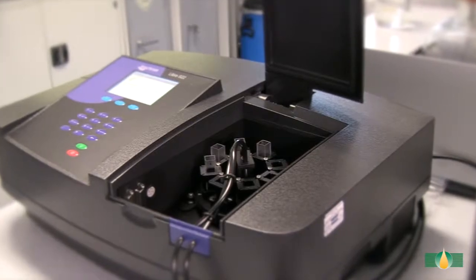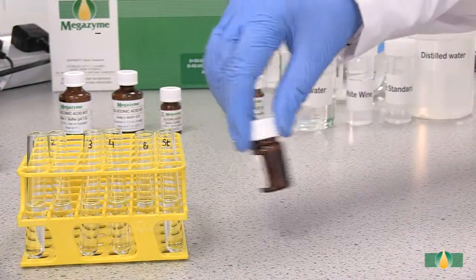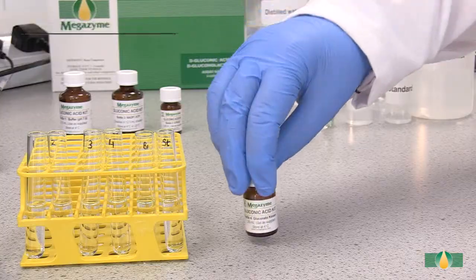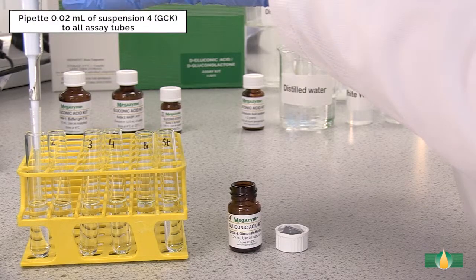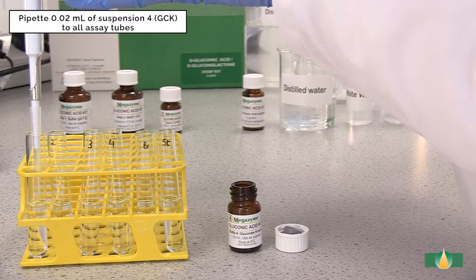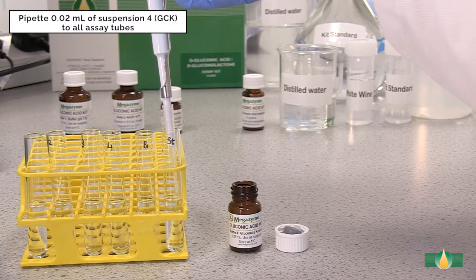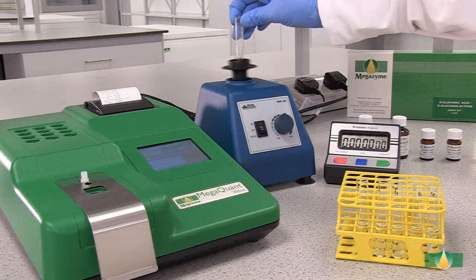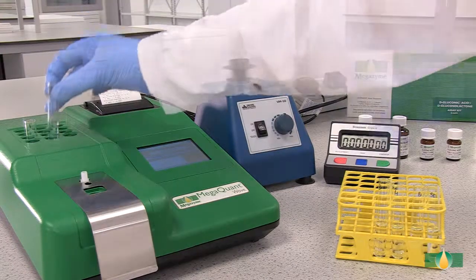Alternatively, a recording spectrophotometer with 1 cm path length cuvettes can be used. Swirl to mix the contents of bottle 4 prior to dispensing. After recording the A1 absorbance value, pipette 20 microlitres of the trigger enzyme gluconate kinase into all of the assay tubes. Mix the tubes thoroughly and incubate them at 37 degrees Celsius for 6 minutes to allow the reaction to go to completion.